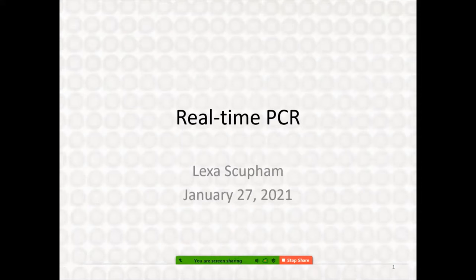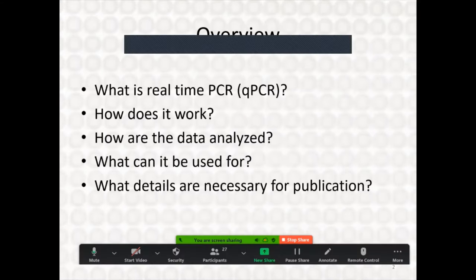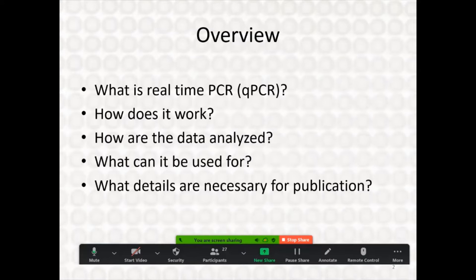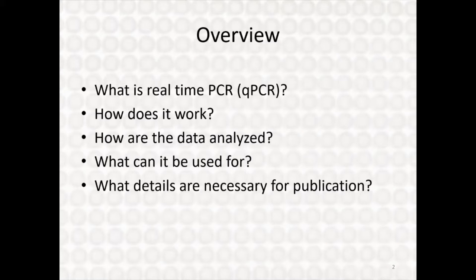Welcome everybody to real-time PCR, this is the third in the series. Tomorrow is troubleshooting — please don't miss it. What I'm going to talk about today is first of all what is real-time PCR. I will often refer to it as qPCR, which stands for quantitative PCR, to discriminate it from RT-PCR which is reverse transcriptase PCR. There are qRT-PCRs which are real-time reverse transcriptase PCRs. There is a lot of literature that refers to real-time PCR as RT-PCR, which can be incredibly confusing.